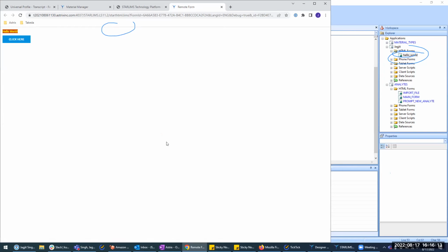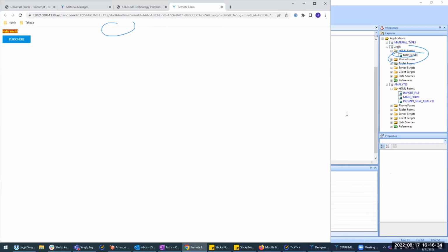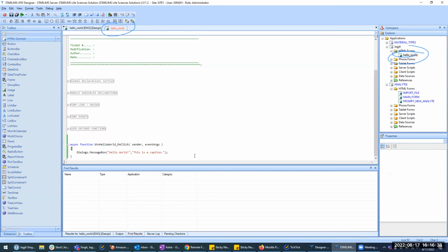Remember, some of the parameters were for the buttons. So you can default some buttons in there instead of OK, like cancel or yes, no, right? So you can ask questions to the user like, are you sure you want to delete? That could be a question. And then yes, no could be the parameters. For that, you would go back into global find and then look for a dialog message box that has a delete, or you would look at a delete button and see how that was implemented, right? So those are ways to learn this thing.